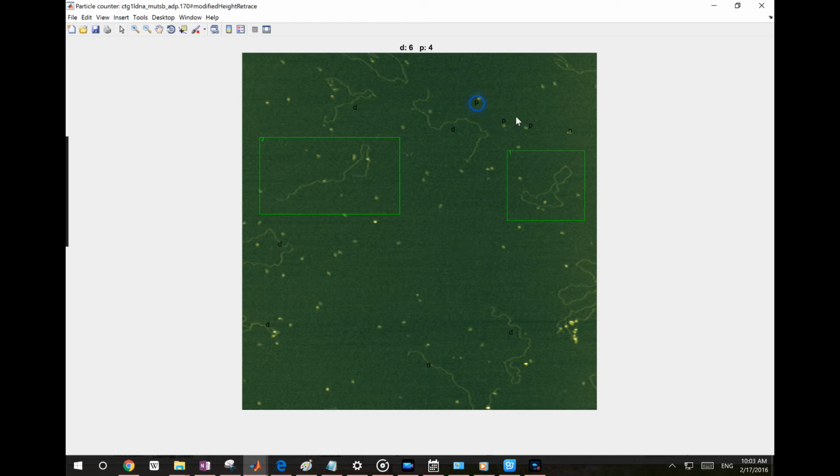And if you see that the text is kind of not easy to see, you can also change the color. Just right-click the image and choose text color. So you can say, let's use green, and now they are easier to see.